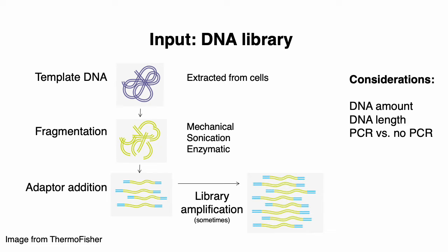This becomes important when you are sequencing certain samples that are rare or hard to find. You could imagine that if you're sequencing cells within a tumor, for example, so-called cancer stem cells, which are a rare population of cancer cells, you might not be able to get that many cancer stem cells, in which case you might need a protocol or technology that uses less input genome material.